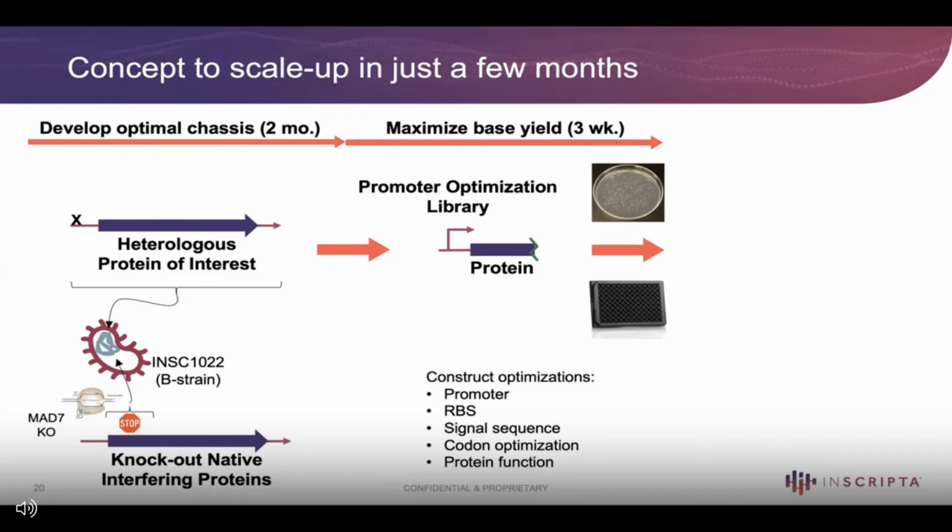So here we were optimizing the protein production. Here you can bring to bear all of the other gene-specific libraries that we talked about previously, doing promoter-based and RBS screening for improved production, as well as changing any signal sequences or protein tags that are present, and codon optimization in the first several amino acids can be quite important.